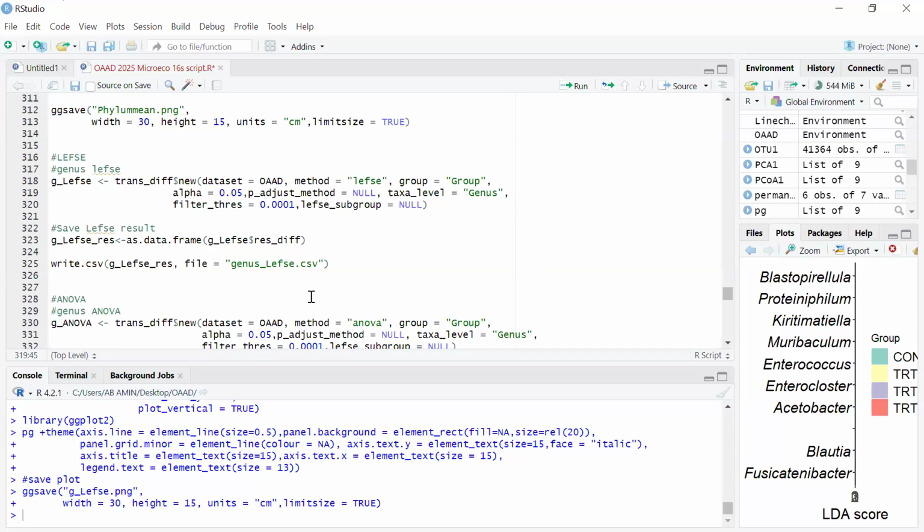If, for example, the family is Lactobacillus, I'm just using it as an example, then it will be unclassified Lactobacillus. Do you understand? The closest to it. I understand. Fair enough. And if that one is not available, you use unclassified with the nearest you can get in the tree. And I have to do that for all my data sets.